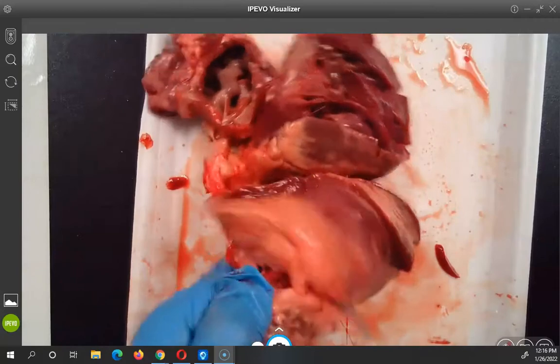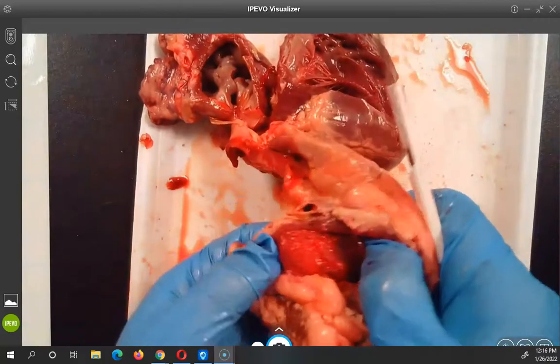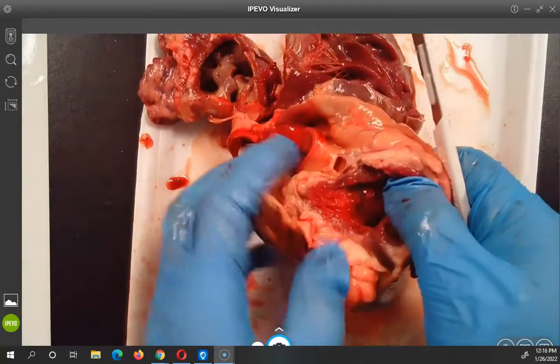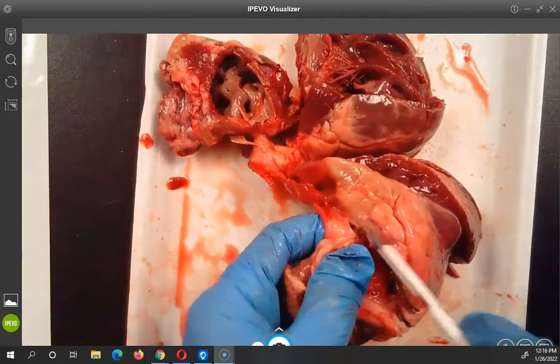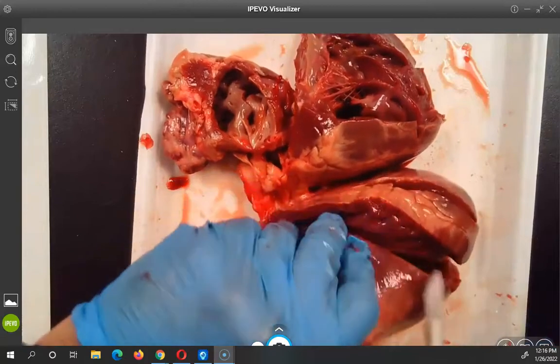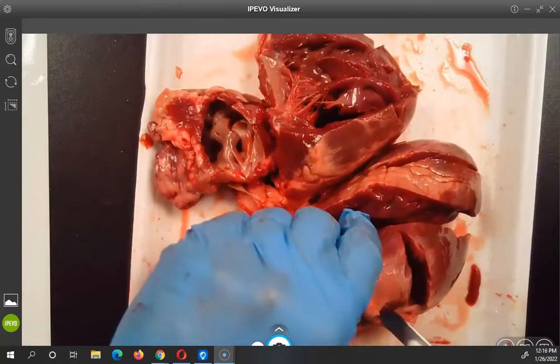That looks cool — that looks like nail polish. I know, it's got a really good red color. Look at that — that's a nice red color.